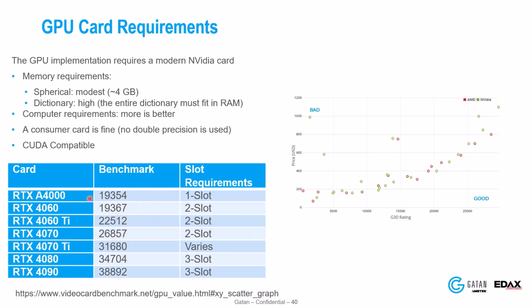As you go up here, you can see these two are pretty similar. To give some idea, I think the laptop that we'll use has a benchmark around 7,000. The one I'm using is about 10,000 in terms of this benchmark value. So the GPU cards can get higher performance, but you can use all sorts of GPUs.